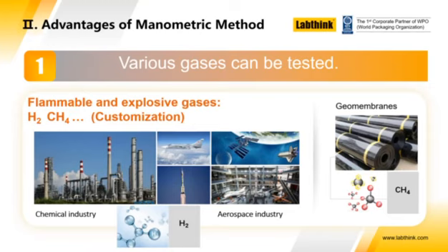We always stress for those customers that would be interested in testing flammable explosive gases that we need to very carefully consider the application and the test conditions, and then propose a specially designed piece of equipment for that application, because we want to make sure that the components used in the construction of the instrument are intrinsically safe or resistant to corrosion, and so on and so forth. And so it's very important to take into account the application during the design of the equipment, but it's possible.